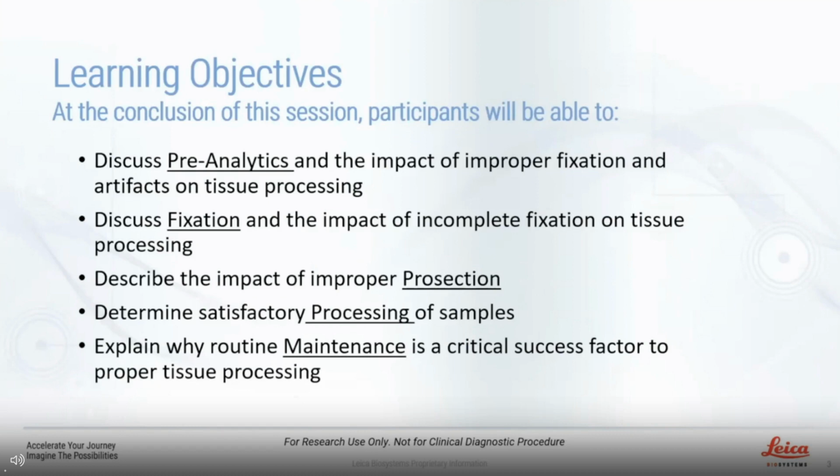Discuss pre-analytics and the impact of improper fixation and artifacts on tissue processing. Discuss fixation and the impact of incomplete fixation on tissue processing. We're going to describe the impact of improper prosection, which is actually the dissection and sampling of tissue, and determine satisfactory processing of samples.